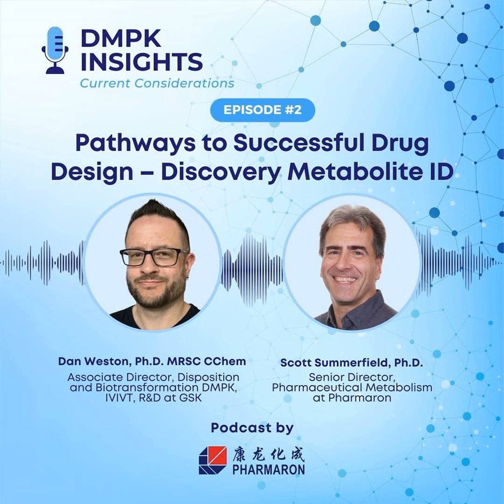And so you use residual clearance samples, intrinsic clearance samples. And did you use precedented metabolic pathways to build the methodology? Yeah, so we wanted it to be as relevant as possible, and it's something that I guess we've been talking about a long time in the biotransformation community, really.